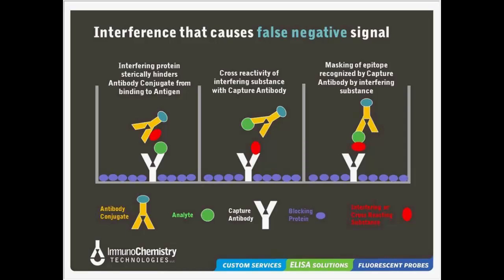So I want to mention a couple other things on this too that we did not have room on here. You can also get human anti-mouse or human anti-other antigen antibodies, and that could actually bind and tie up the capture antibody in such a case that it doesn't function. So it can interfere sterically by coming in and binding to, say you've got a mouse antibody on the plate or some other animal, and the serum for whatever reason has antibody to it. That'll interfere in a negative way, and so you have to try all these things out.